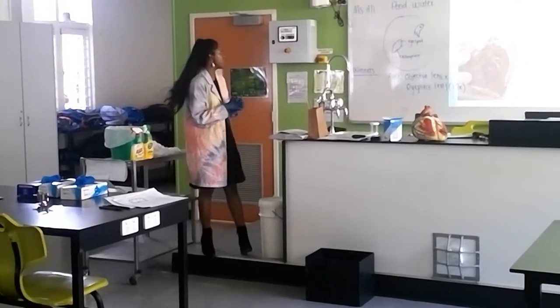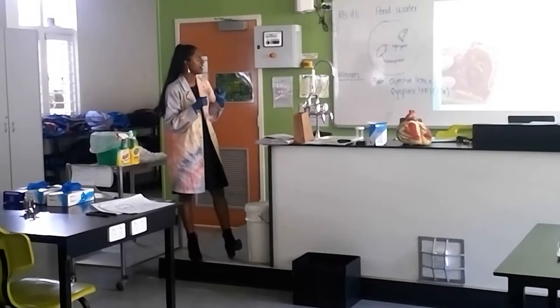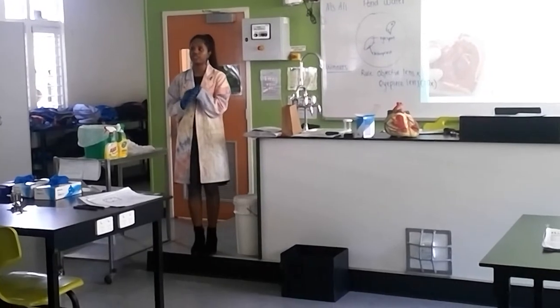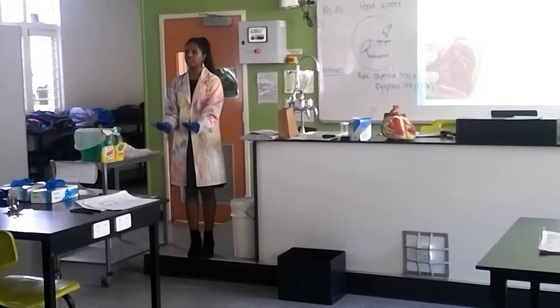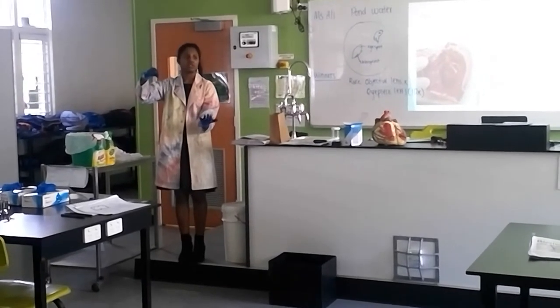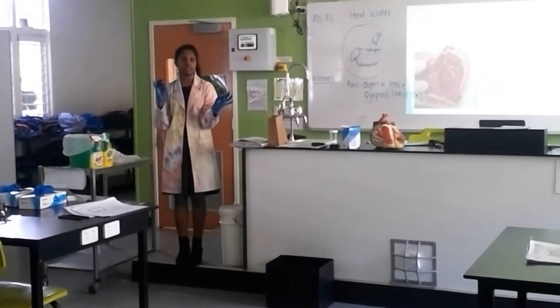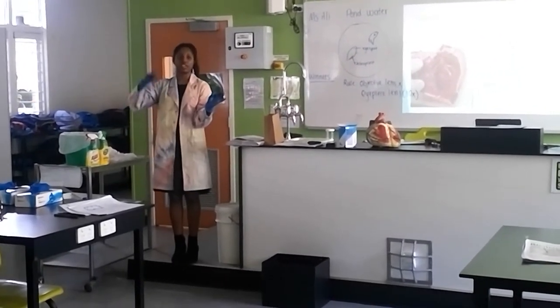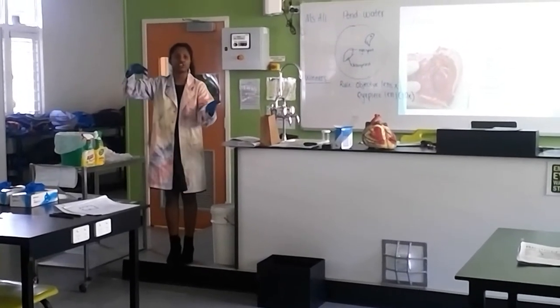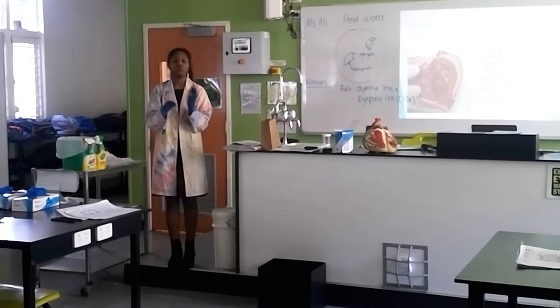Awesome. Alrighty. So now for the fun part, we are going to cut into our heart. Now you are going to be cutting on the left side first. So make sure you've identified where the left side is. We are going to make a small incision with your really sharp scissors. And then I want you to use the thick dissecting scissors to make a cut down. You'll have to cut through quite a bit of fat.